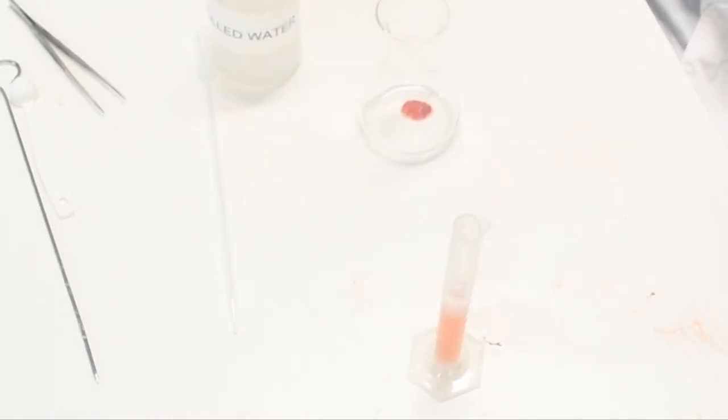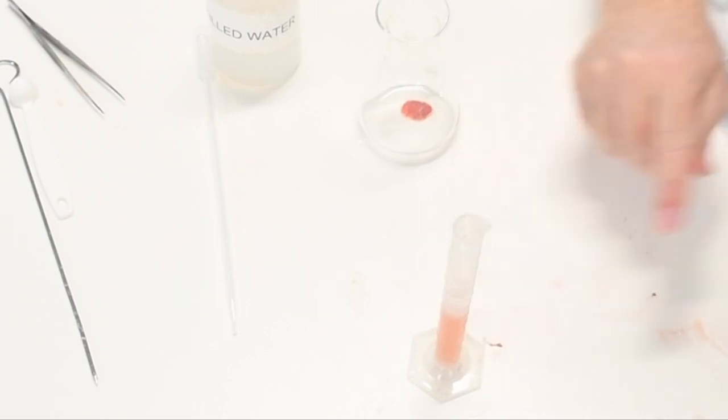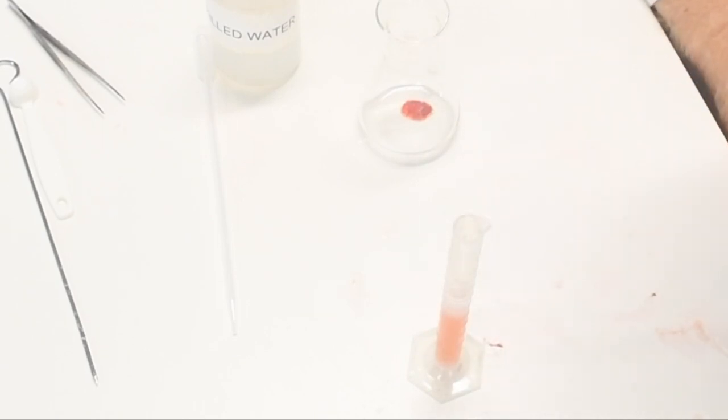Okay, so you can see there's a clear layer on top of the red layer, the pink. Now, can you see what's happening at the boundary of that layer? Where the pink and the clear meet, can you see what's happening? It's going a bit purple. It's going a little bit cloudy, isn't it? Do you know what that is? No. The DNA. So, what you can see there is the alcohol sitting on top of the strawberry liquid.